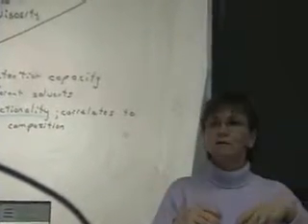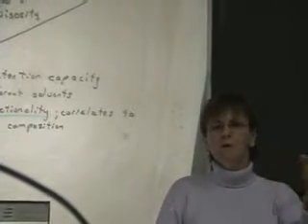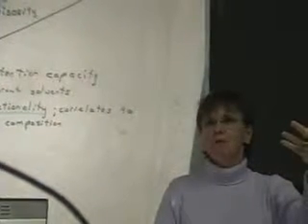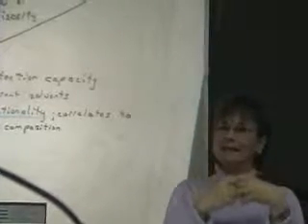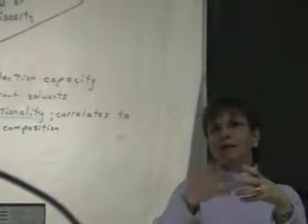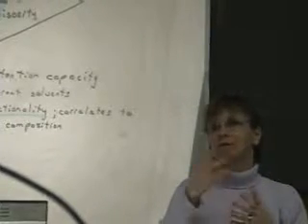But then you centrifuge that system, decant or pour off the liquid that's free, and weigh the sample so you know how much solvent or liquid that flour retained or held onto. So it's always going to weigh more than the dry flour, but how much does it retain? Equal weight of the flour, half as much?